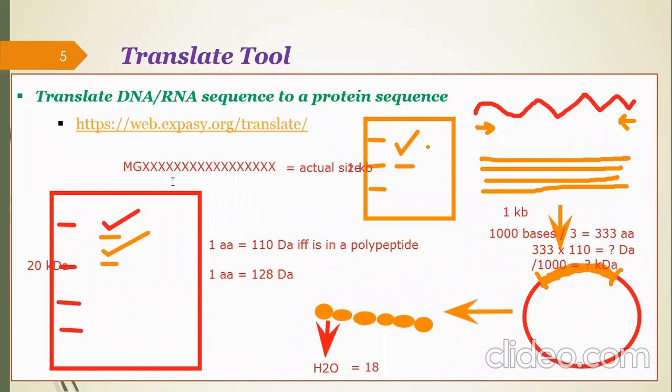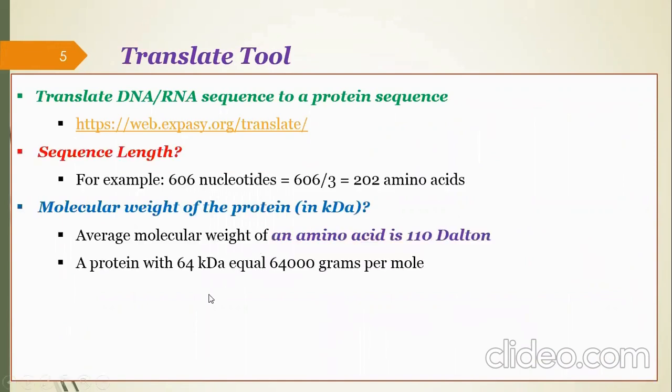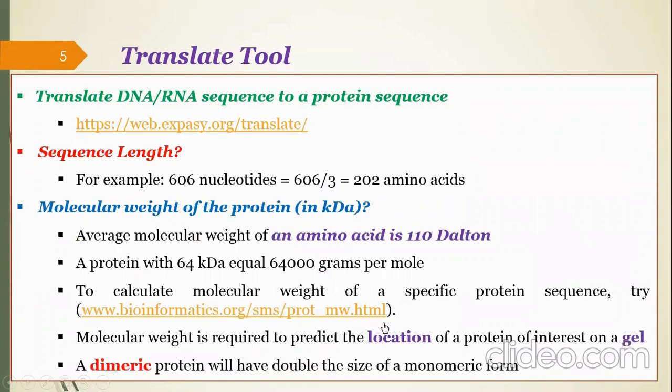Yes. So we need some site from where we could get the actual size of our polypeptide chain. For that we have this tool, this web page, available.